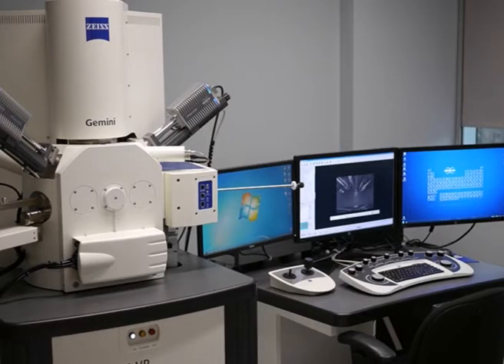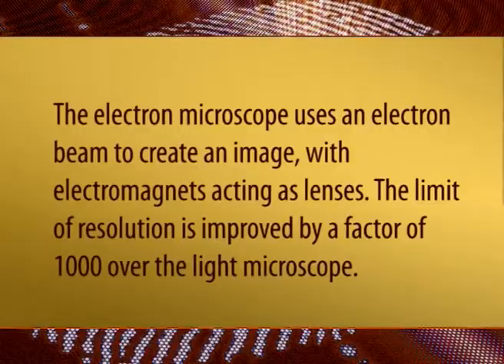On the other hand, the first scanning electron microscope was found in the year 1942, with the first commercial instruments coming in around 1965. Its delayed development was because of the difficulties behind scanning the beam of electrons through the sample. Most microscopes can be classified as one of the three basic types, which are optical, charged particle, that is electron and ion, or scanning probe.